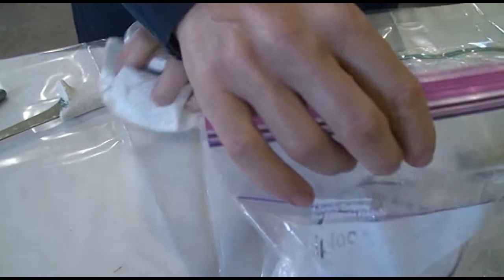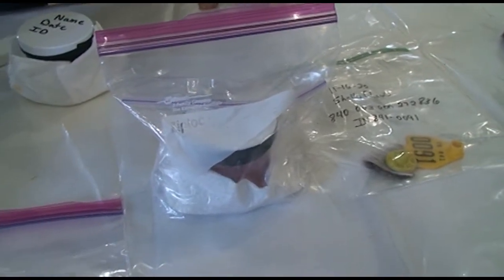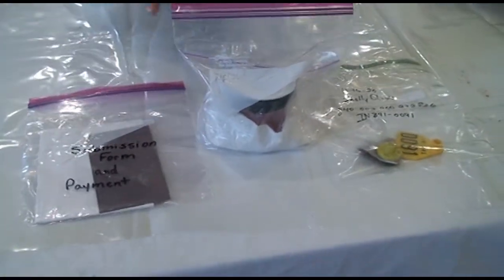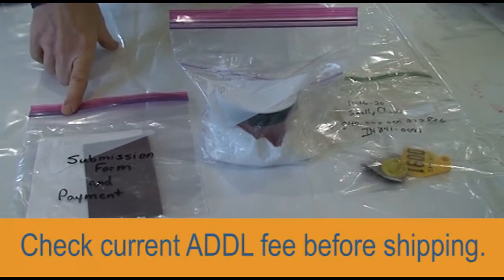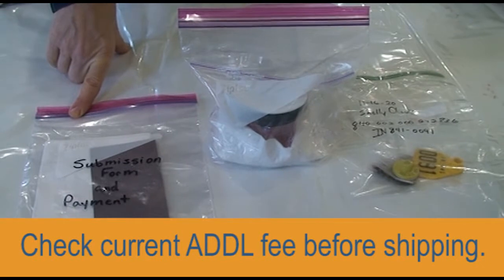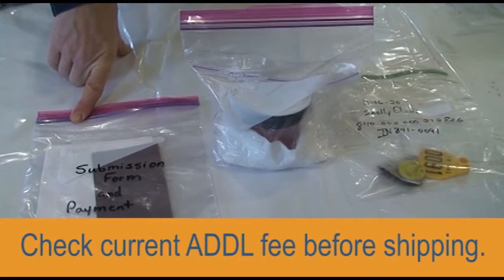And then our submission form and the payment to the diagnostic lab goes in another Ziploc bag. So we have 3 bags, quart-sized bags, and then we put all 3 of those into a gallon-sized bag for shipping. The payment, the checks are made payable to Purdue University, and for a formalin jar right now, the amount is $37. That could change, it hasn't for quite some time, but for right now it's $37.